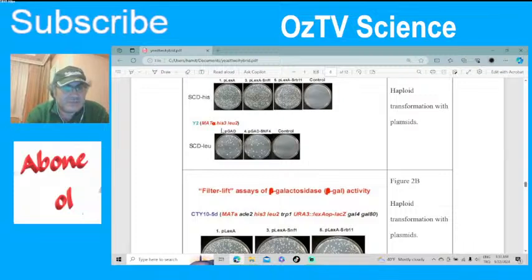So this is plasmid number 2, synthesizing the activation domain protein, and then plasmid number 4, synthesizing the activation domain protein along with SNF4. This is the second hybrid. In this experiment we expect the combination of the two to work, because that's our working combination.